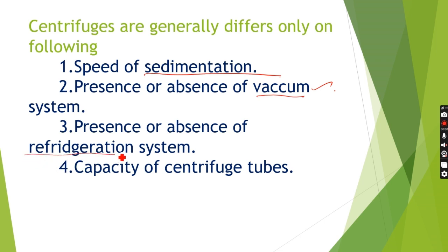Then the refrigeration system. When there is increased centrifugation, that is an increased number of revolutions, it leads to an increase in heat. The heat production affects the sedimentation.